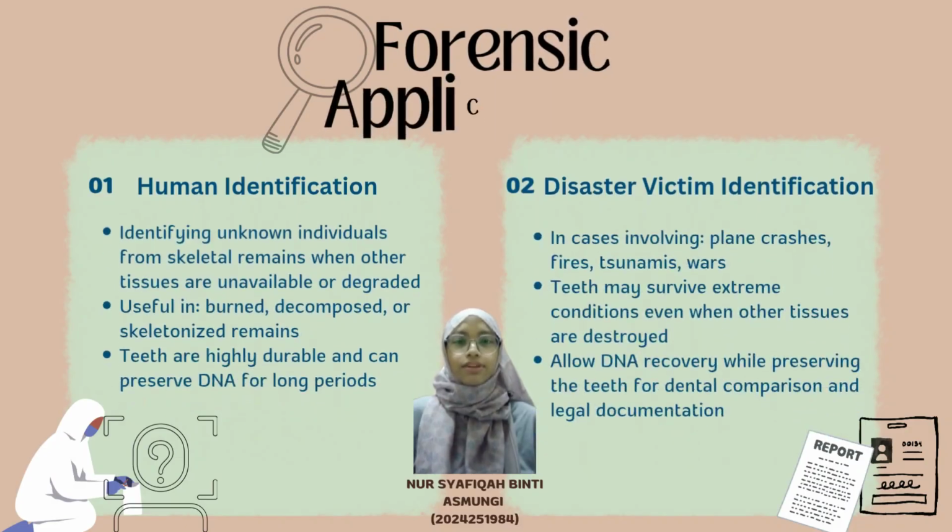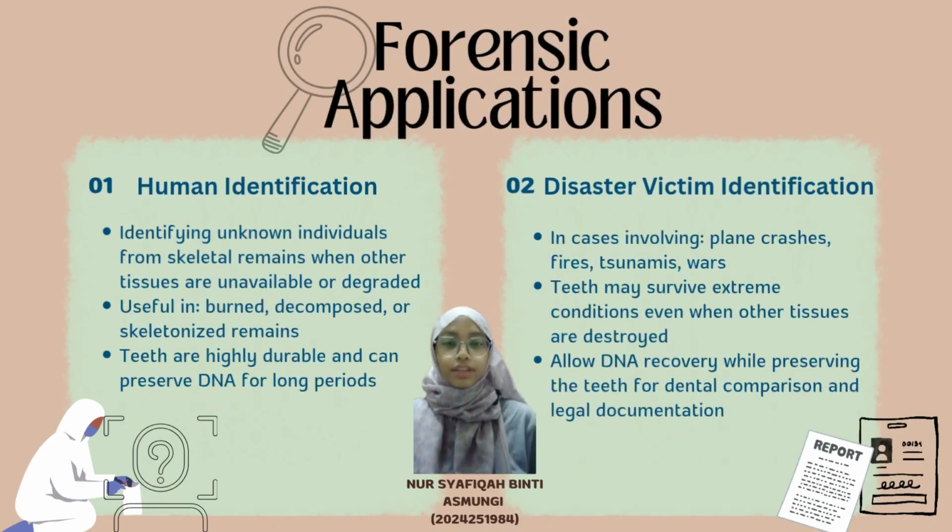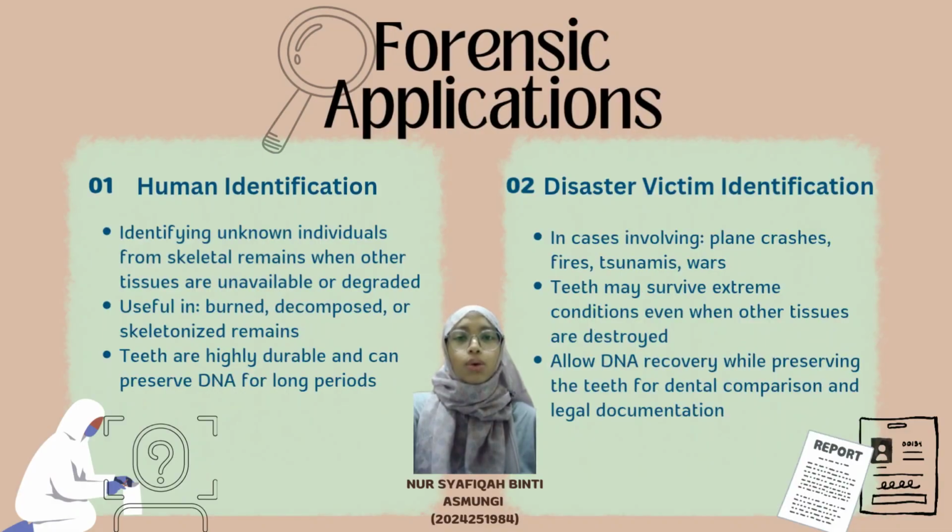This method has several important forensic applications. The first is human identification, to identify unknown individuals, particularly in burned, decomposed, or skeletonized remains, where other soft tissues are unavailable or degraded due to environmental damage, because teeth are highly durable and can preserve DNA for long periods.